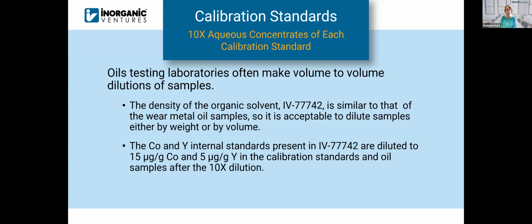Cobalt and yttrium internal standards are present in this solvent, IV 77742, which after dilution, the concentration of the cobalt is 15 micrograms per gram and the yttrium is 5 micrograms per gram. And that is in your calibration standards and in your samples.